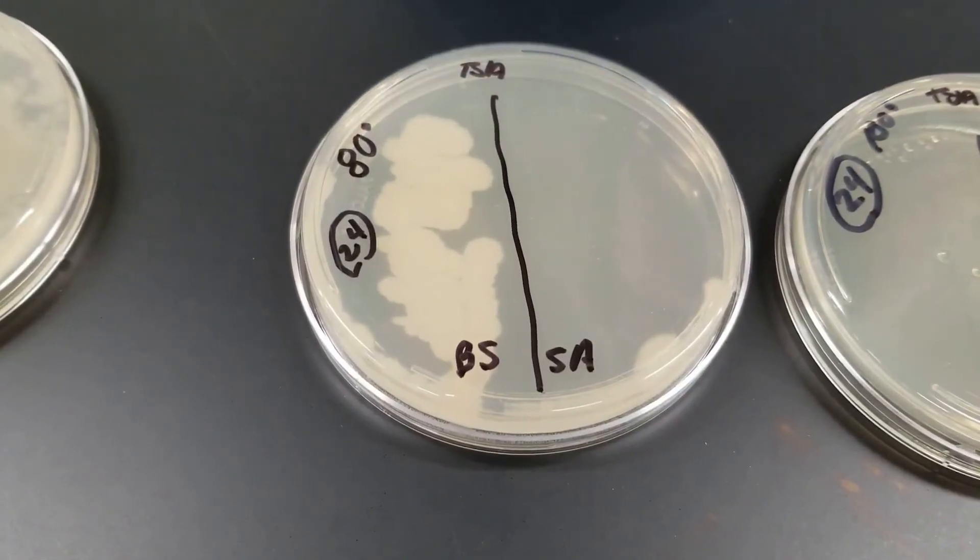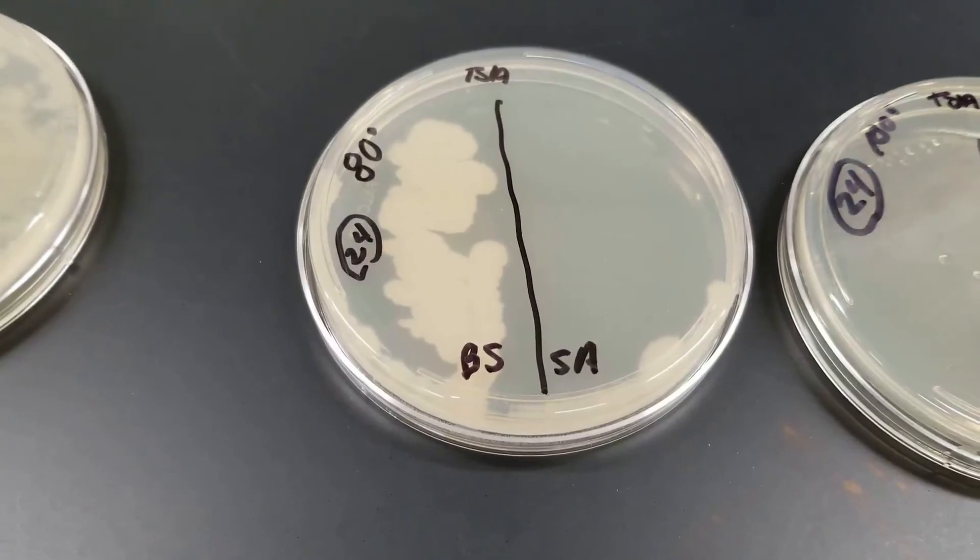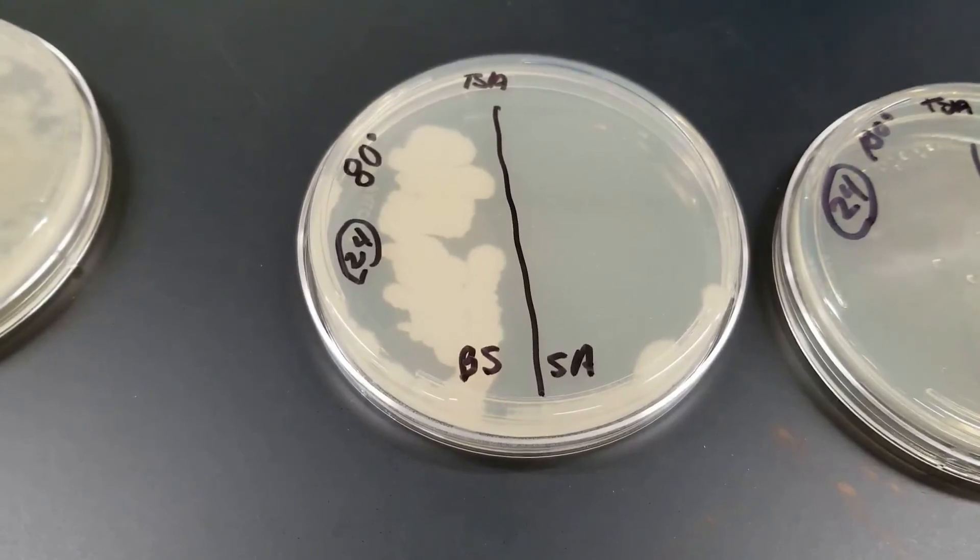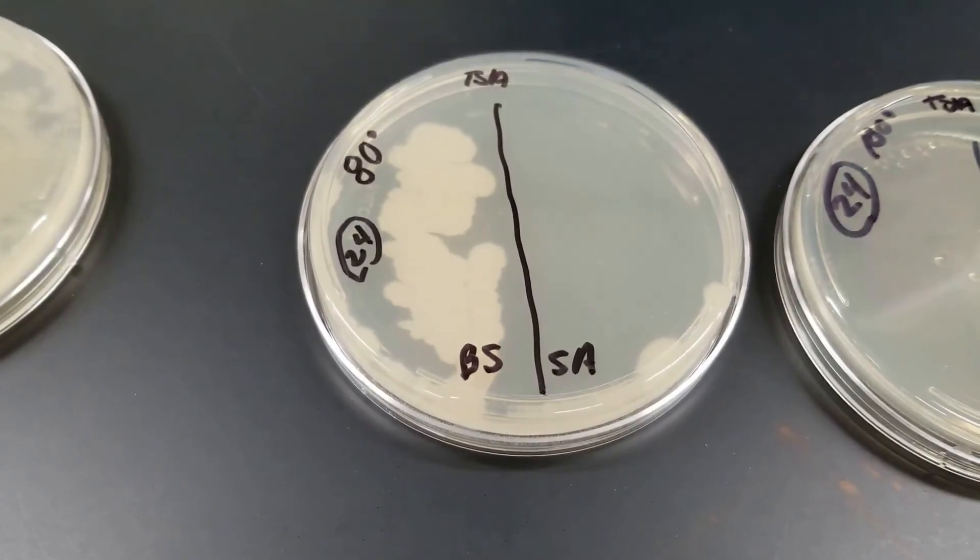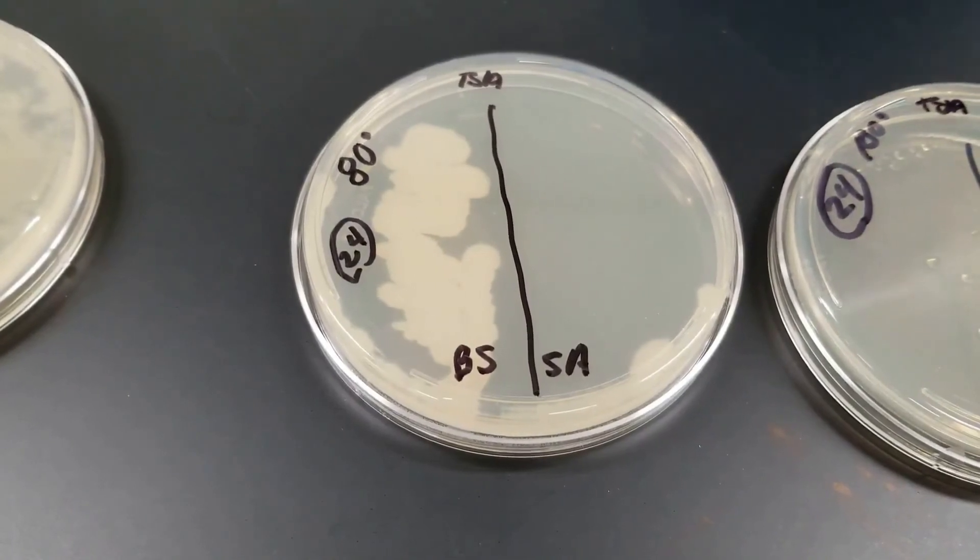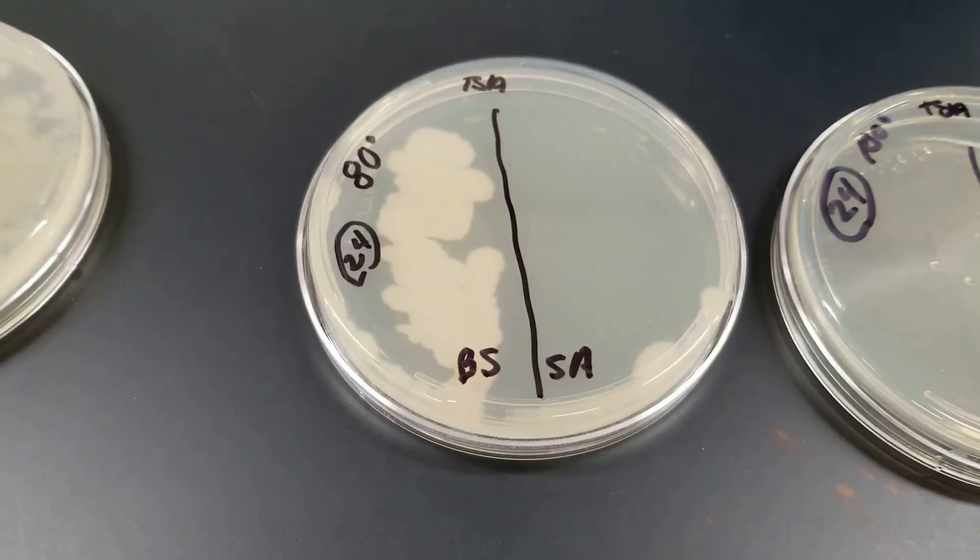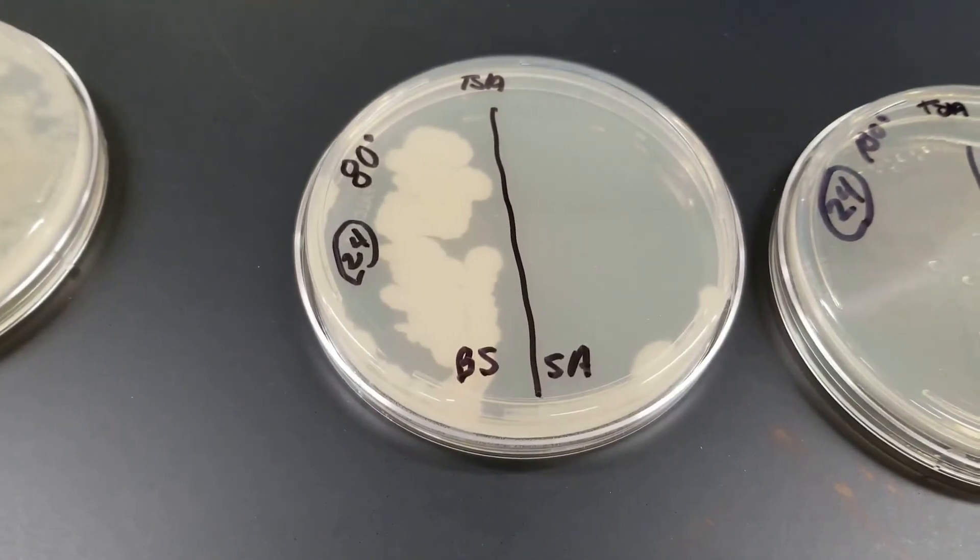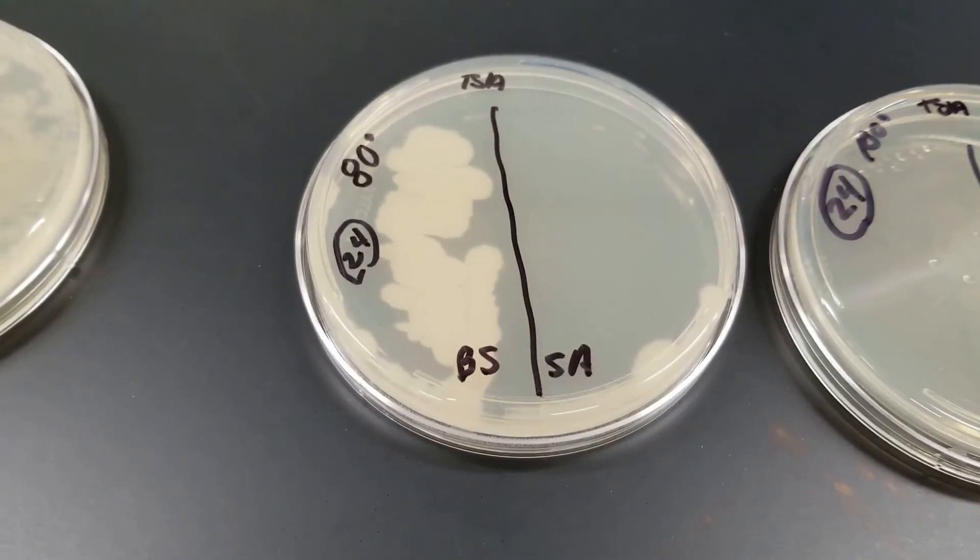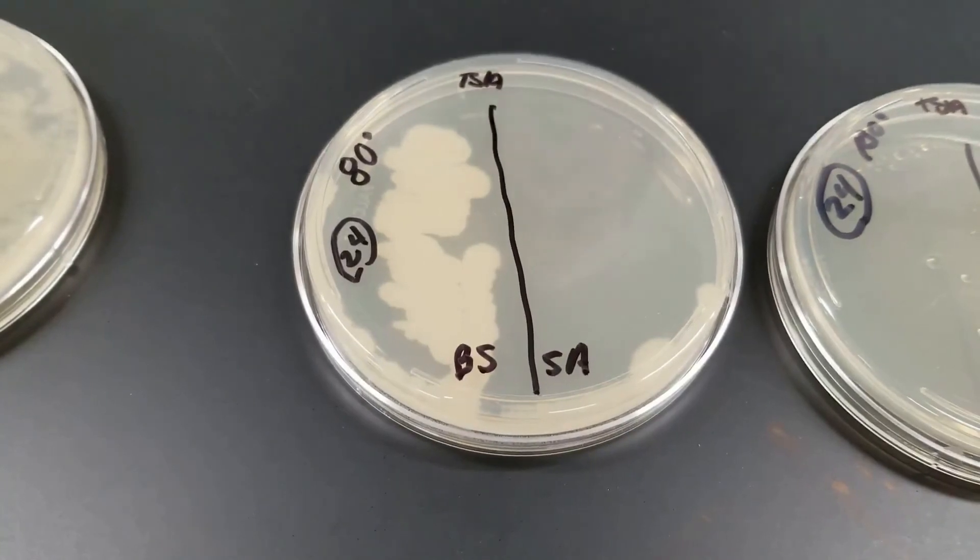Bacillus subtilis did survive. Now, this is where you may be seeing the effect that Bacillus has a spore. So the vegetative cells may also have been killed, but because they produce spores, the spores afterwards were able to germinate and we see the growth there. Production of spores allows bacteria to survive adverse conditions. And when favorable conditions return, then it can grow. So it's a survival mechanism.